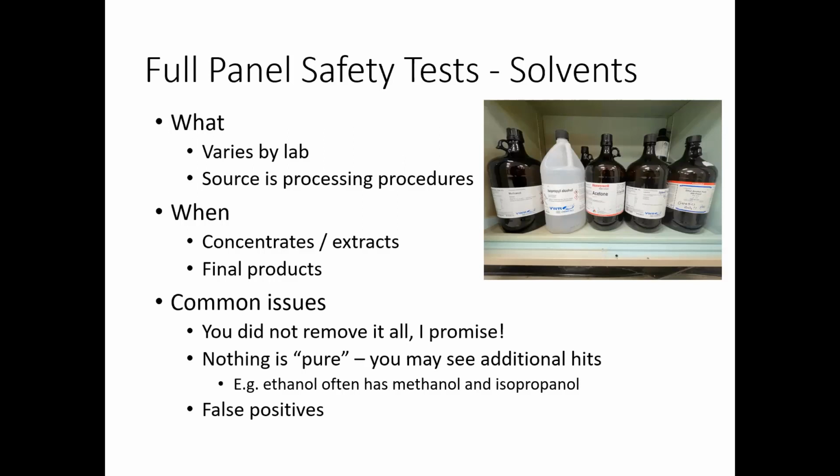That's one thing I've seen pop up in different scenarios, and try to work through with folks. What their lab really should be doing, what any lab really should be doing, is having blanks that test the lab air alongside the real samples when they're doing solvents. Because keep in mind, in the lab, like this picture here from my cabinet, we use solvents as well, and they're volatile. They are in the air, and we have fume hoods and circulation and all of that to try to keep it cleared out for many reasons.